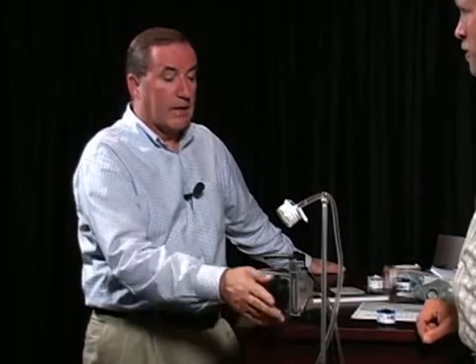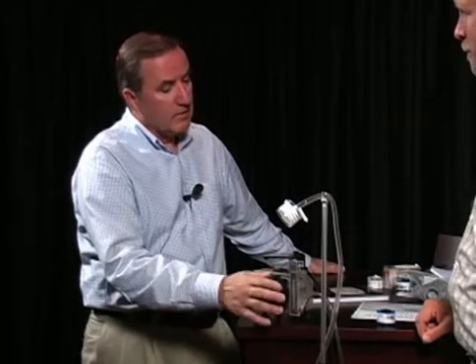And there are timers that you can buy to start and stop exactly for 10 minutes or whatever time you want. There are inline timers. I recommend that you get them. That way you know for sure, and that way you could leave it unattended.